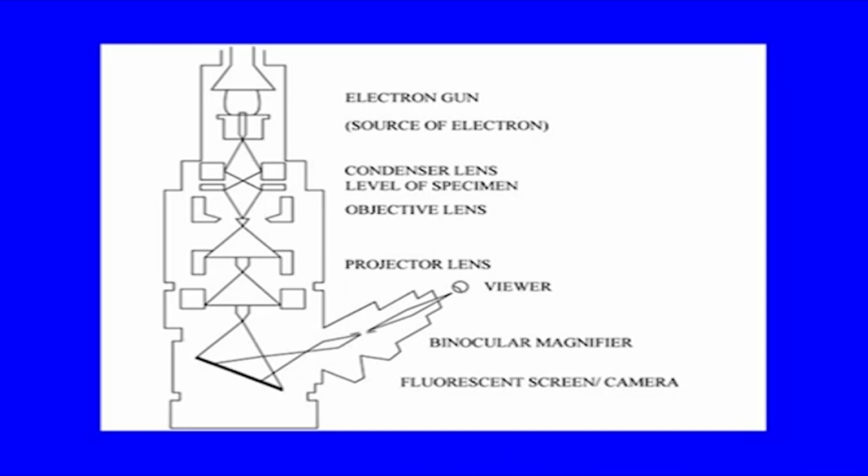So, this is just to give you a feeling of the light microscope and electron microscope. Here we have, just to align them, the upside down light microscope. Now, if you see here the light microscope lamp, which is a halogen lamp or certain for the simple light, and this is a filament, a cathode, for producing electrons.